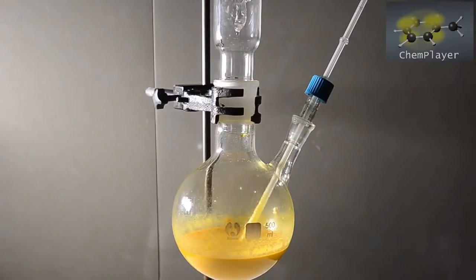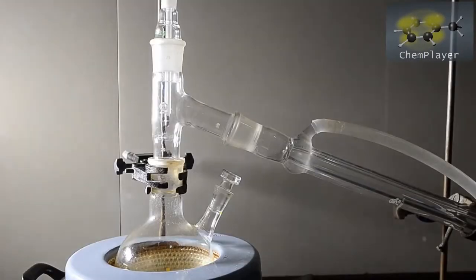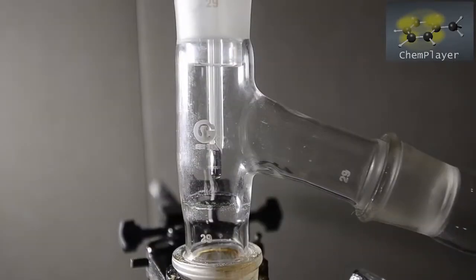After an hour we allowed the flask to cool a bit. And then we swapped around the apparatus, setting up for simple distillation of the flask contents. We're using the heating mantle now so we can apply strong heat. And we're using the thermometer so we can see what's coming off.